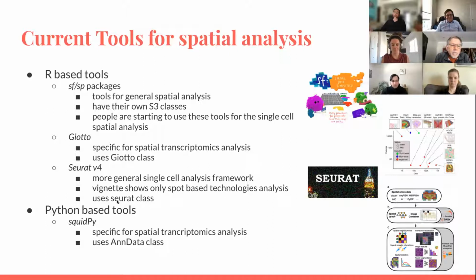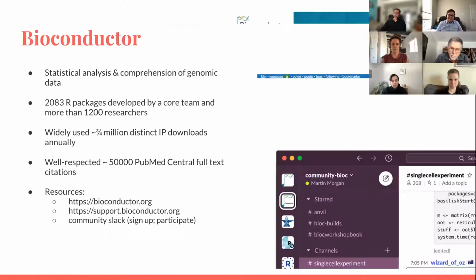Outside R, in Python, we have this Squidpy package, which is specific to spatial transcriptomics and has been developed by the same developers of the Scanpy tool. And I think there could be some interoperability between the Python and the R packages in Bioconductor in the future.